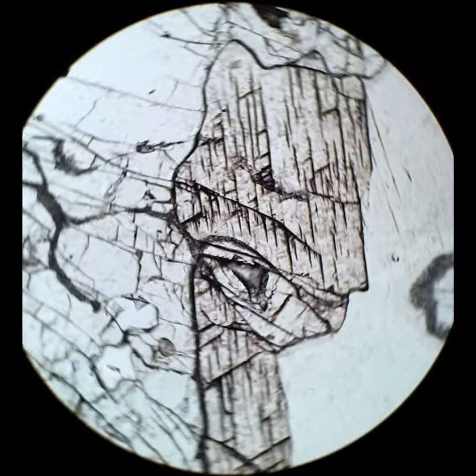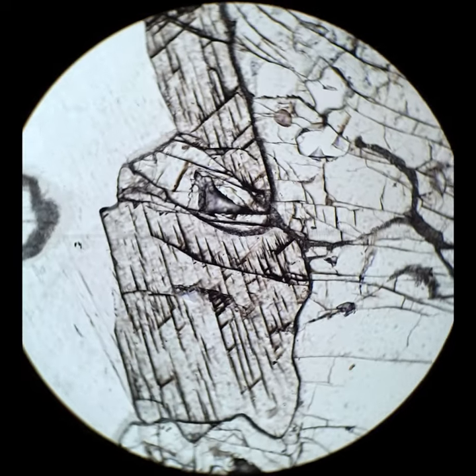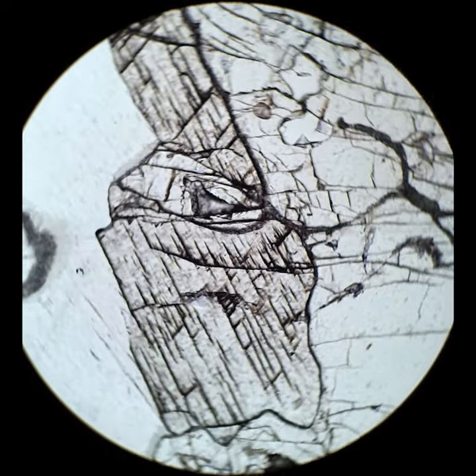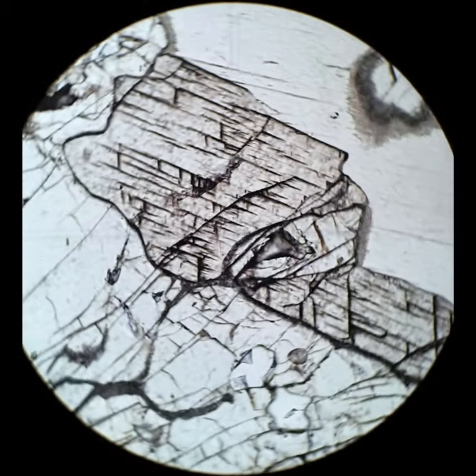Kyanite has a cleavage that runs parallel to the length of the prisms — those are the thin lines — and it has parting, which are the short, fat lines that are at an angle to that. There's muscovite in this as well. That's the green mineral up at the top, and you can see a couple of cleavage planes there, very thin lines parallel to each other. Muscovite goes extinct when those cleavages are approximately parallel to the crosshairs.